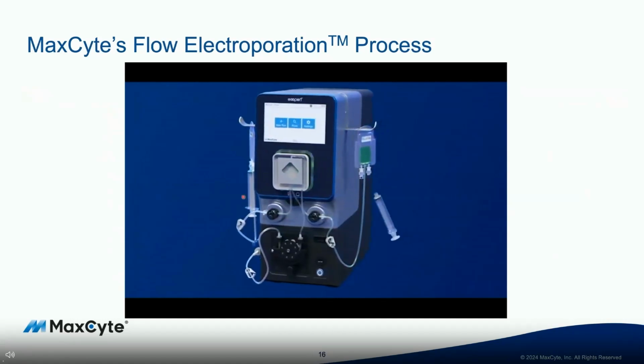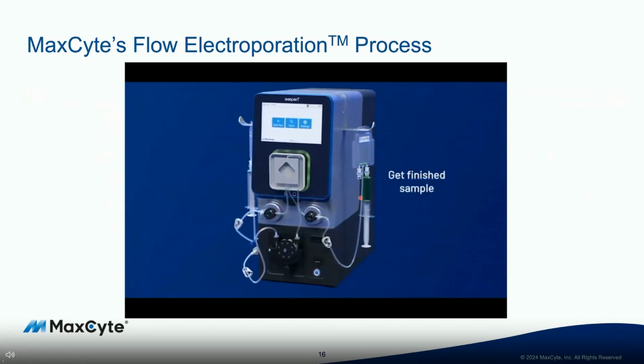And while this video shows a manual loading and harvest of the cells, it can be a closed process where you can bioweld the tubing to instrumentation upstream or culture vessels downstream of this electroporation process.